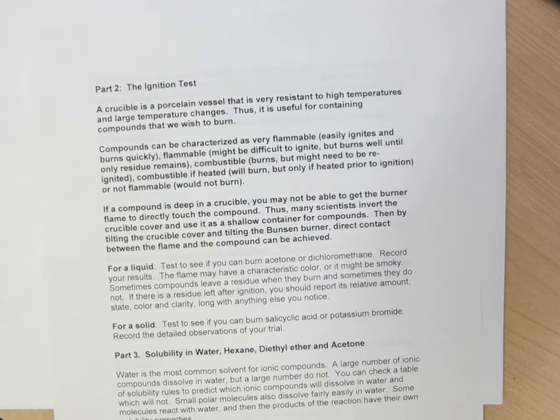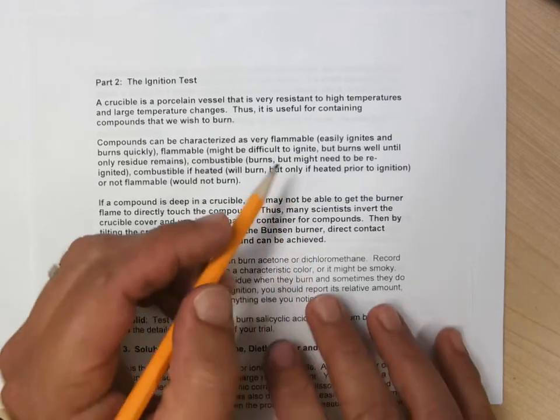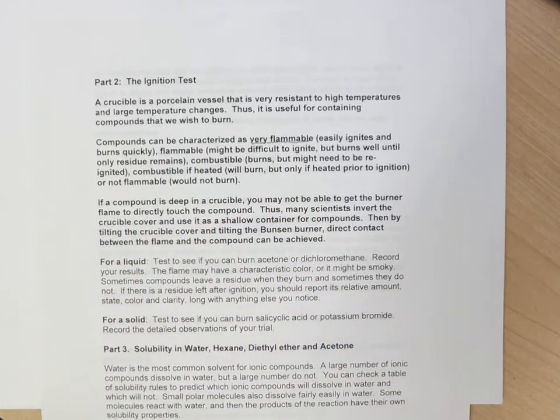The second thing that we're concerned with is, is the material going to burn? Is it flammable or not? And again, the descriptions are a lot of times more rich. It's not just does it burn or does it not, but what conditions does it burn under? So something's very flammable, and a lot of times it's good to write what you observe when you try to burn something, because that's again more detailed than just a single word description.